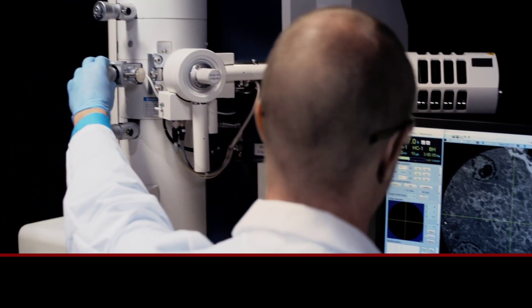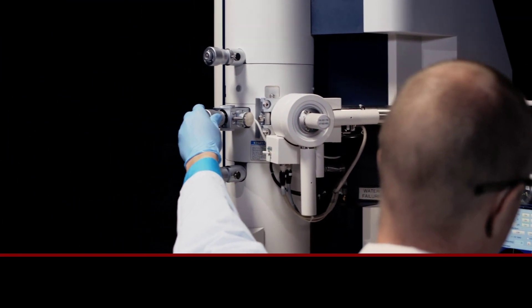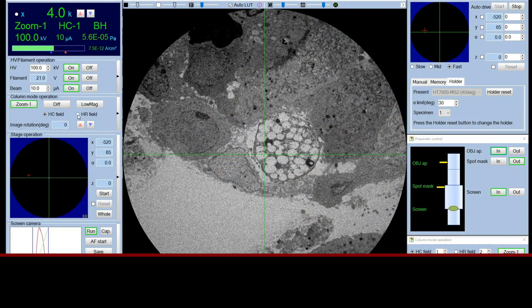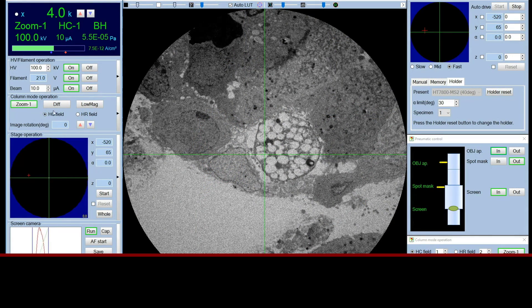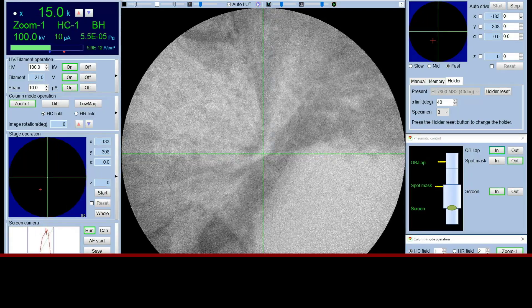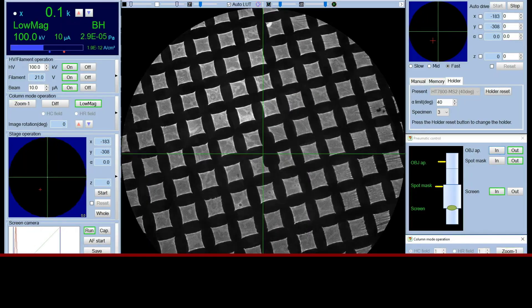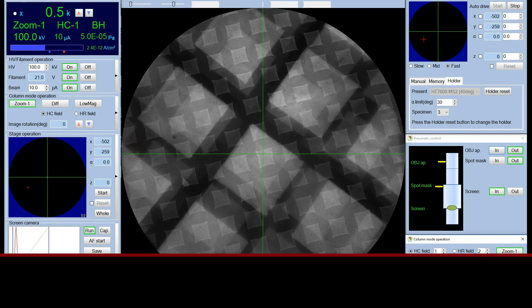This TEM features a unique dual-mode objective lens system, whereby with a single click the electromagnetic field of the objective lens can be altered, creating conditions optimized for high-contrast imaging or high-resolution imaging. The HT7800 is like getting two microscopes in one. No need to compromise.